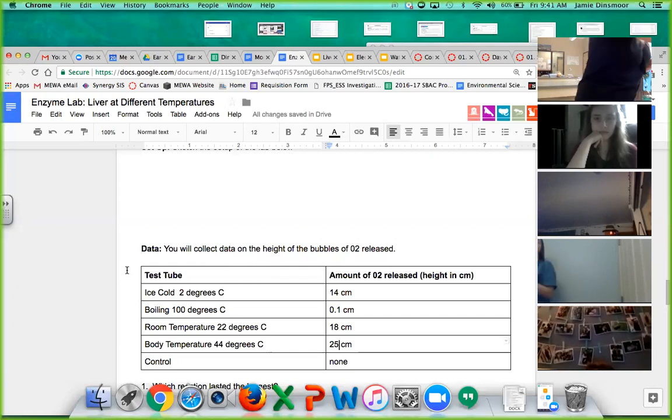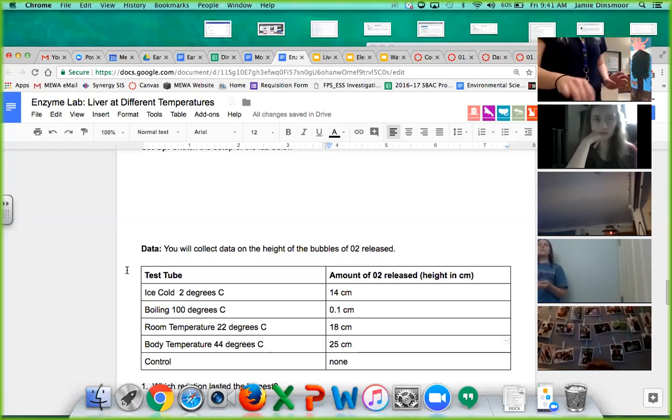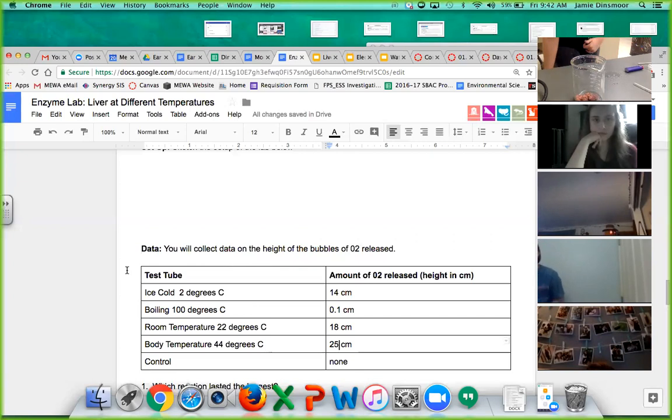So we'll go ahead and get a nice, large piece of liver. And we're going to pour quite a bit of hydrogen peroxide right at this point. We're not concerned with the bubbles, per se. We're more concerned with proving that the bubbles are oxygen, right? So the amount that we're using here isn't going to matter. I might have to do it multiple times.